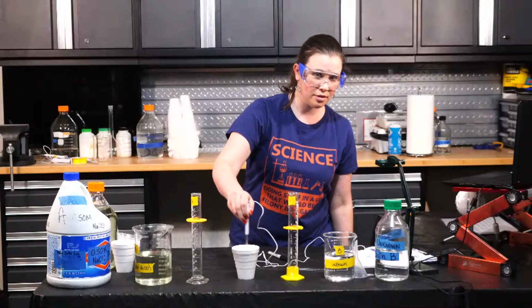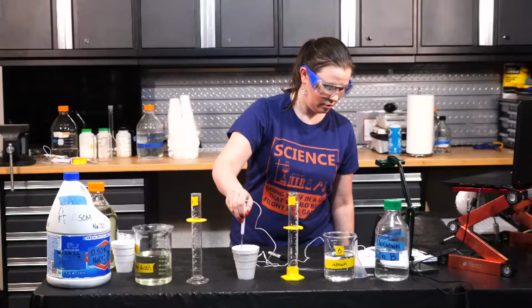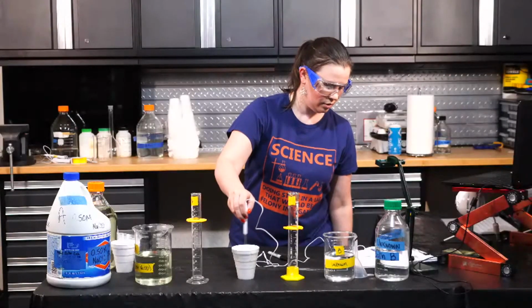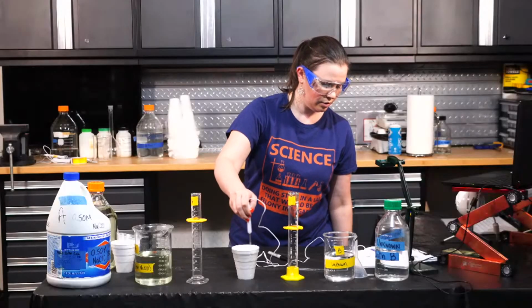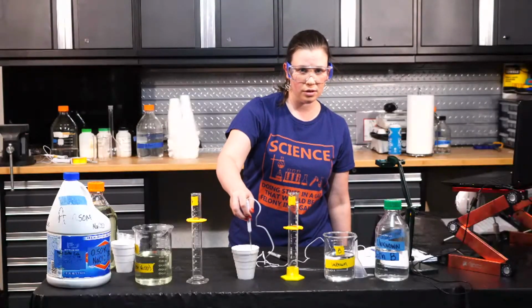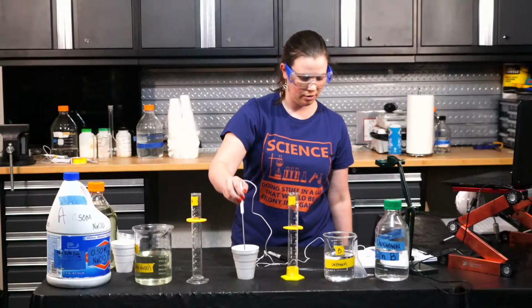Notice I'm mixing this in a styrofoam cup. There's probably a reason for that. Still at 25.6, and still at 25.6. So I'm going to call this the max temperature for level 2, 25.6 degrees Celsius, starting at an original 19 degrees Celsius.